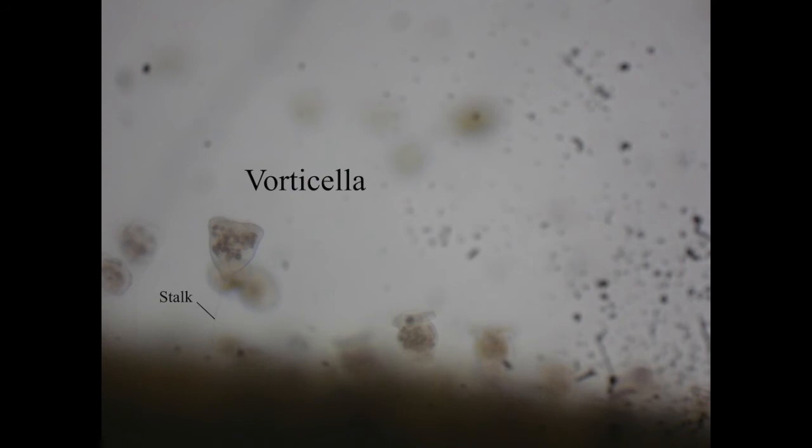There are a few microorganisms you can find that have this kind of long stalk or tube — this one is vorticella. You can just about make out the stalk, and these are very, very tiny. You tend to find them in quite large groups. I've taken a video of this on a separate YouTube video. What they basically do is they ping — they'll be there attached with their stalk and then suddenly they disappear completely. I was lucky enough to see a big group of them together on the edge of a bit of pond weed.